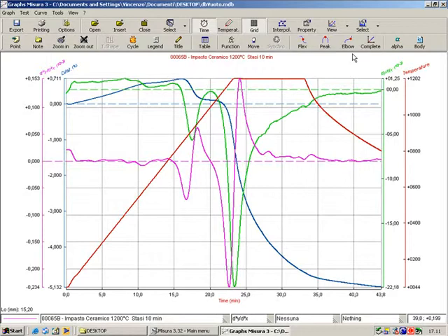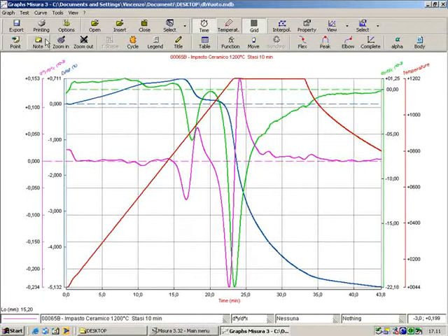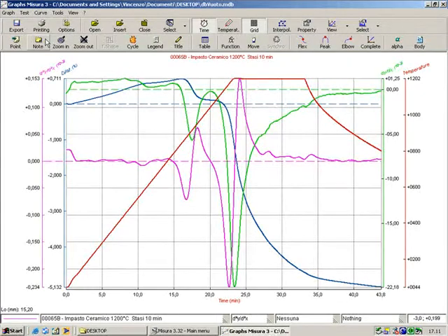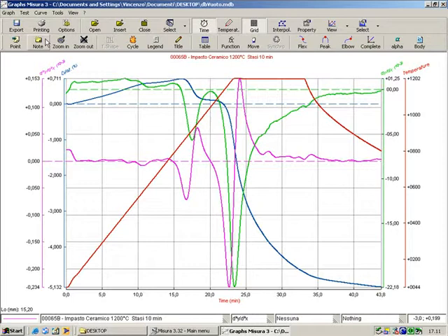This is an example of a graph of the sintering test. The red curve is the temperature. The blue curve is the expansion contraction. The green is the derivative of the sintering against time or the sintering speed. The lilac curve is the second derivative of the sintering.